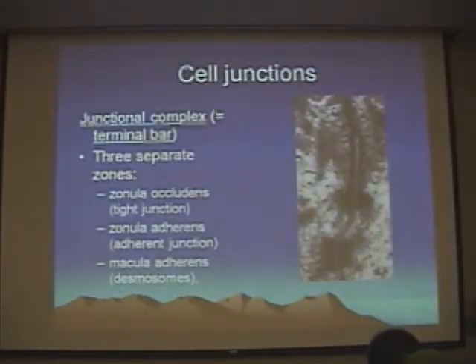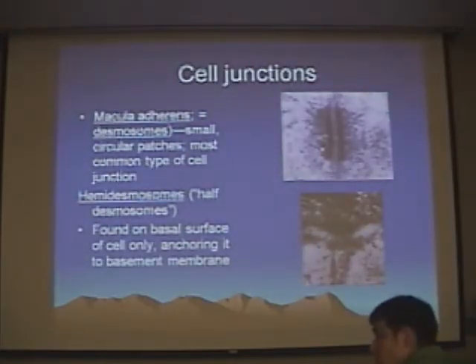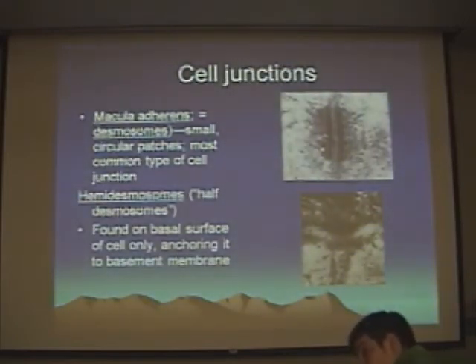Yeah? With the desmosome, how would we differentiate it from going back all the way to the nuclear core? Sorry? Differentiate it going back to like the nuclear core. When it looks dark like that. Yeah, the nuclear envelope. Oh, to just a nuclear envelope.